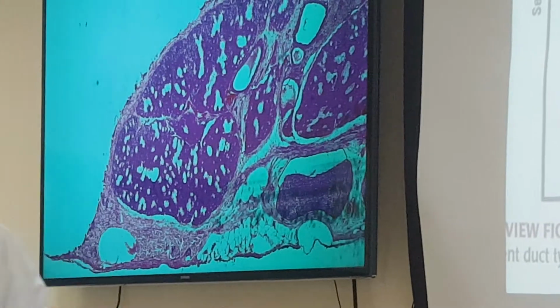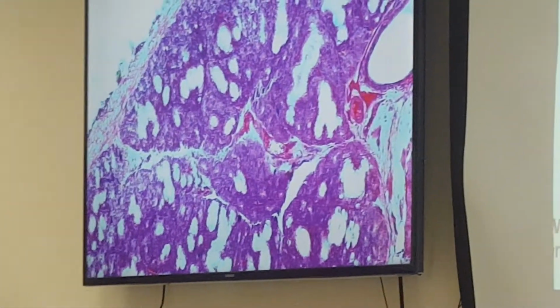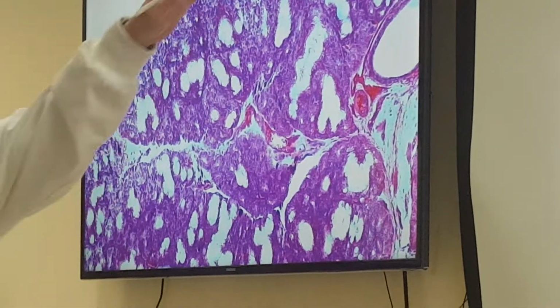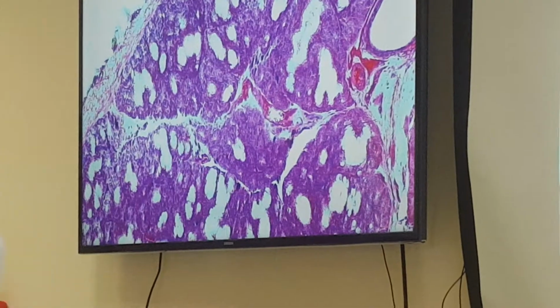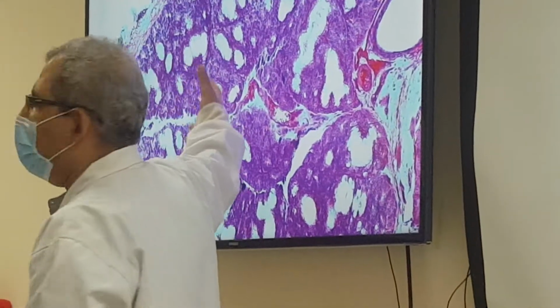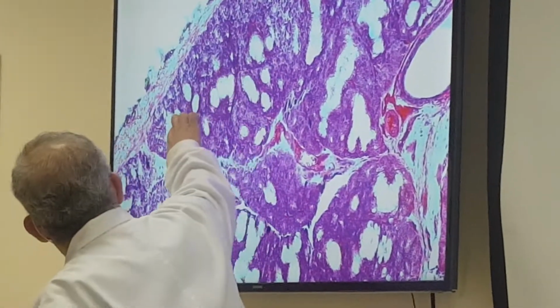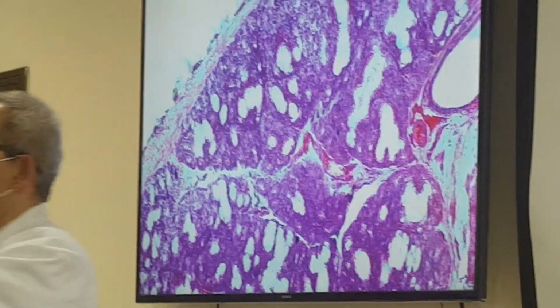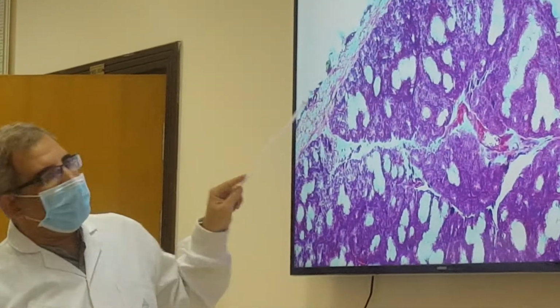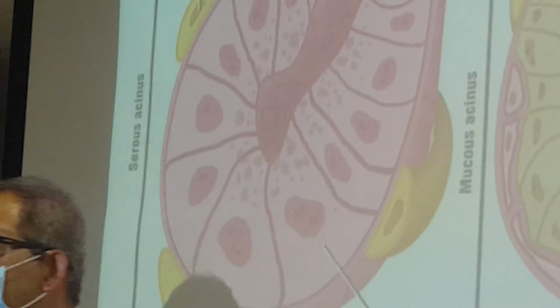Okay? I will go now to higher magnification. It's now here. Again, you won't see really the typical thing like the drawing. All the time a drawing just shows you the typical thing. But with this section, it's the real thing that was cut through. These areas are the section, and these areas are the inside of the duct, which just got cut in the middle.